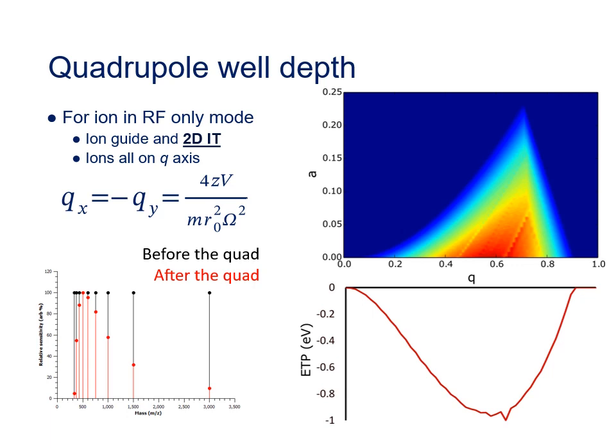So just because in a mass spectrum you see lower intensities of very high mass ions compared to lower mass ions, that may not necessarily be solely because there were actually fewer of those components in the original sample. This may be an artifact of the fact that your ion beam has passed through one or multiple quadrupole components in the instrument before being detected. And this effect can be seen whether we're using our linear quadrupole as an RF-only ion guide or as the central section of a linear ion trap.